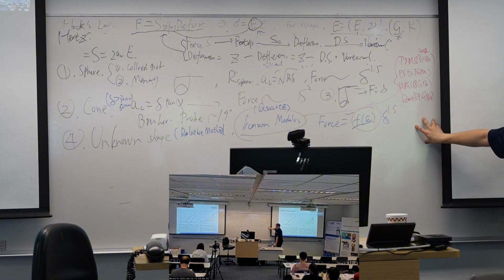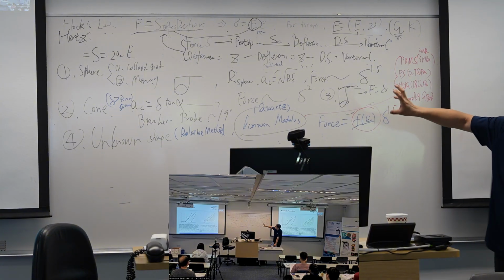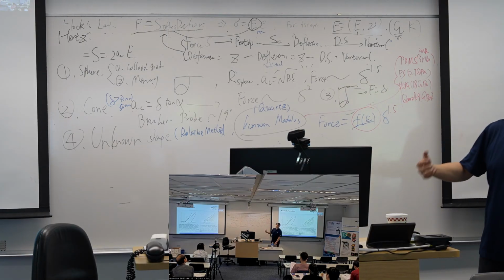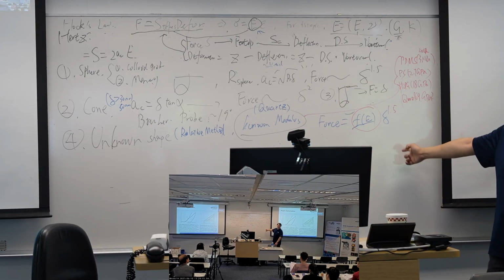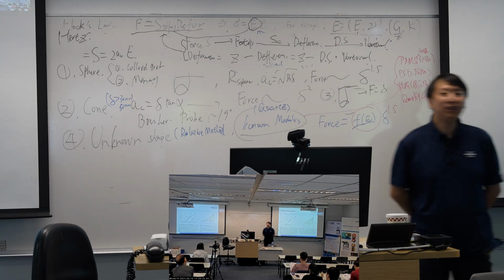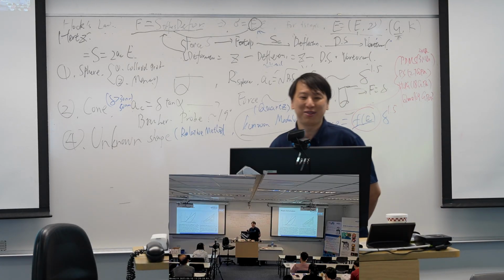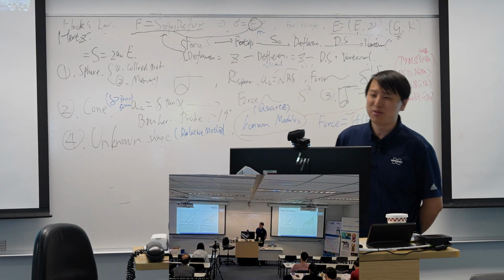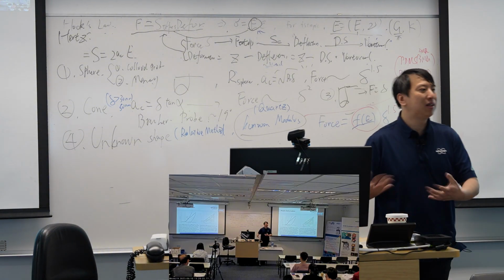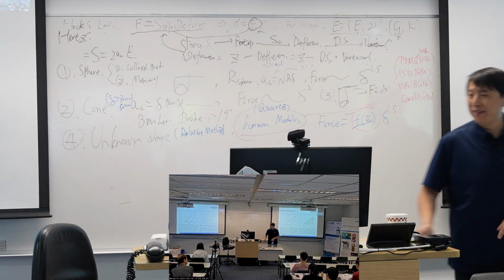And once that's in the software, you can choose your contact model, and then the software will give out the modulus. That's the whole idea. So that's about the force curve part. We will have some hands-on session for you to practice, and if you have your own sample, maybe we can do a simple demonstration.